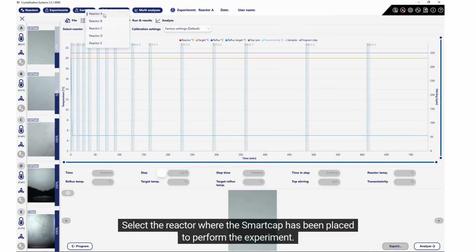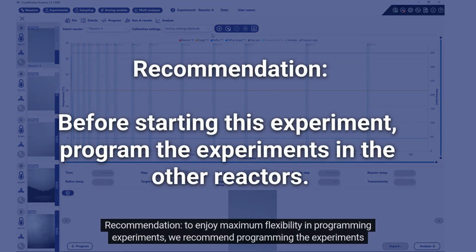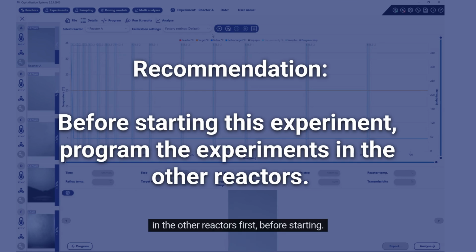Select the reactor where the smart cap has been placed to perform the experiment. Recommendation: to enjoy maximum flexibility in programming experiments, we recommend programming the experiments in the other reactors first, before starting.